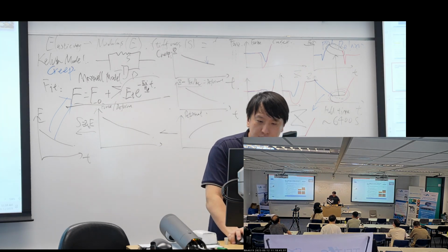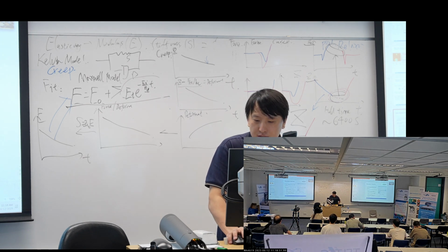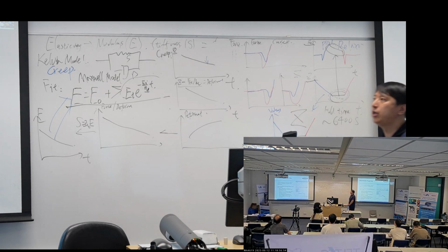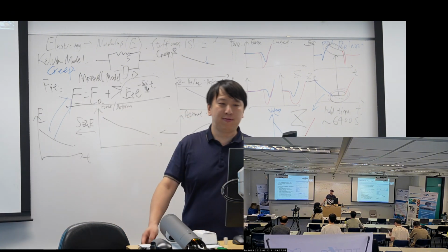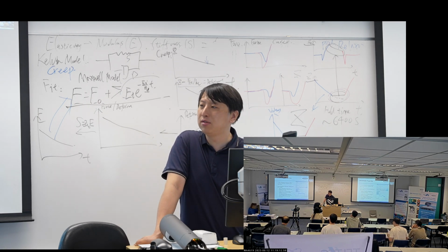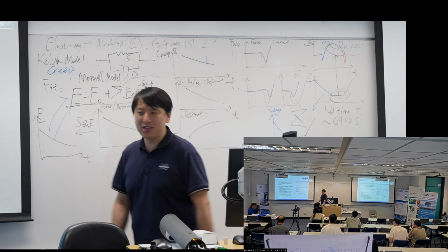Okay, so besides this one, Bruker provides a more complex option. Bruker gave this option a name called ramp scripting. The ramp scripting is actually a function Bruker copied from the JPK materials, I mean the JPK bio AFMs, after purchasing them.